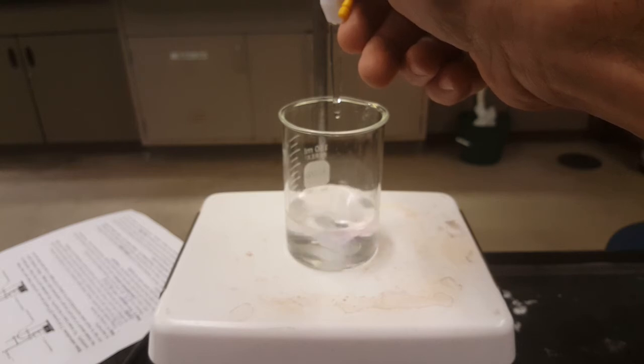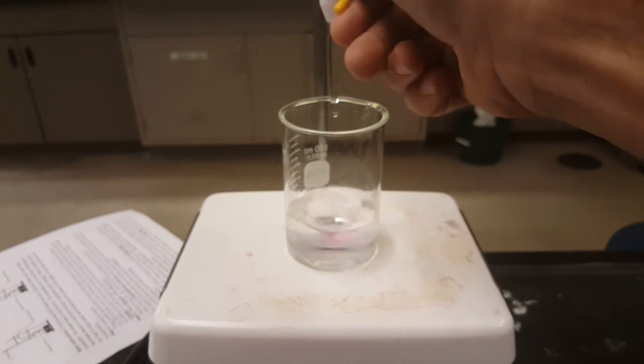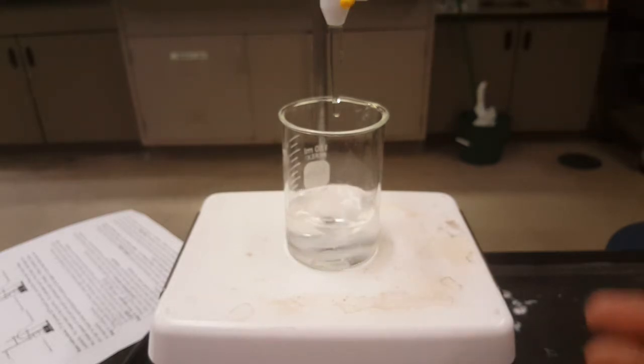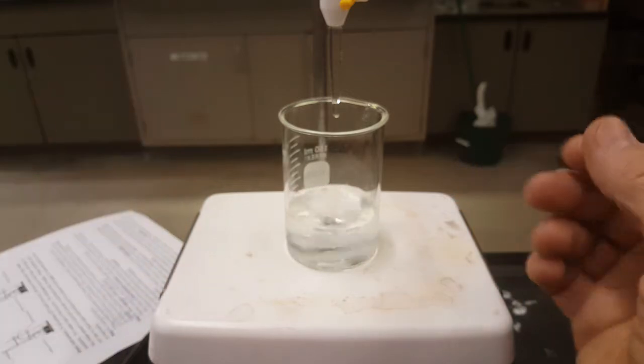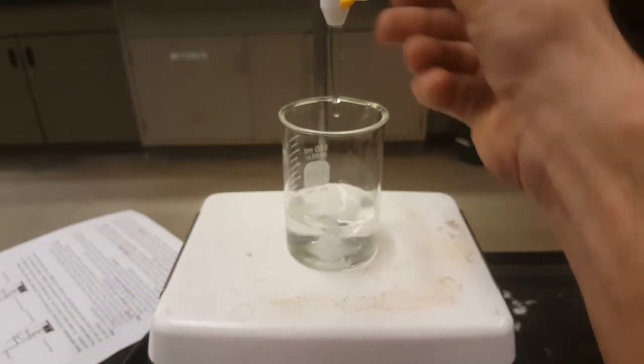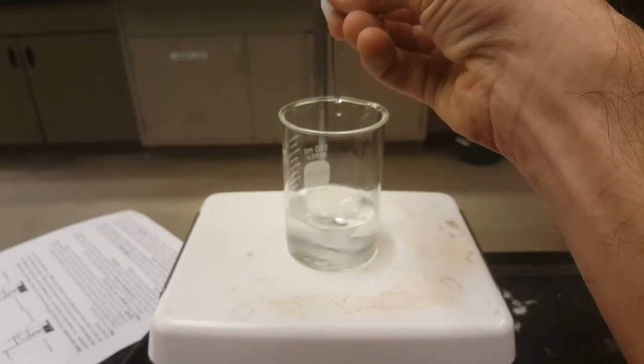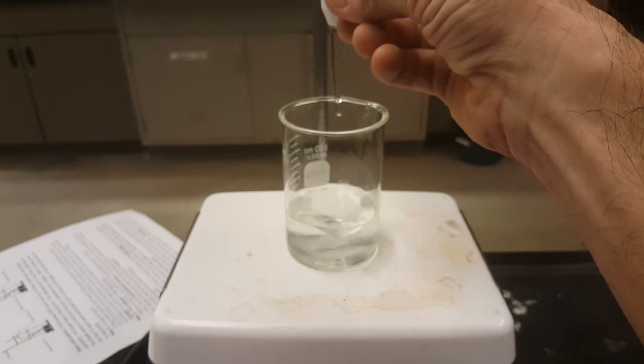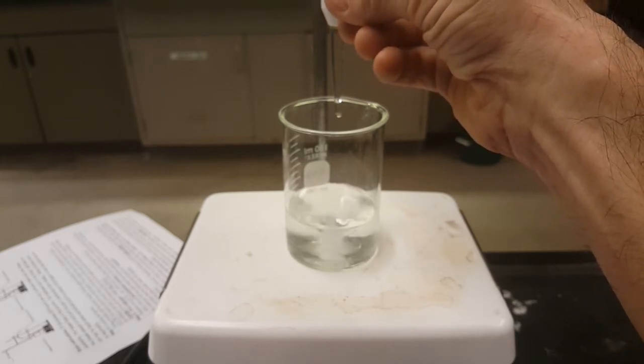Okay, now you can tell the pink is flashing with every drop, and we're getting really, really close. I can't tell you how important it is to take your time at this point, because every single drop adds enough.